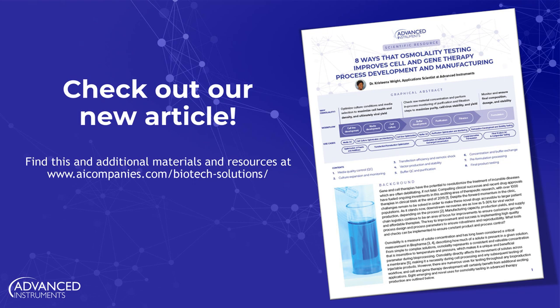So when we're talking about measuring, especially when it comes to bioprocessing, osmolality is a key measurement and really something that's probably more valuable as a measurement because it has that independence from outside factors like temperature and pressure. That's a great point because I feel more and more it's important to have that parameter that's independent of these other factors. Right. And this seems to be a question we always do get.